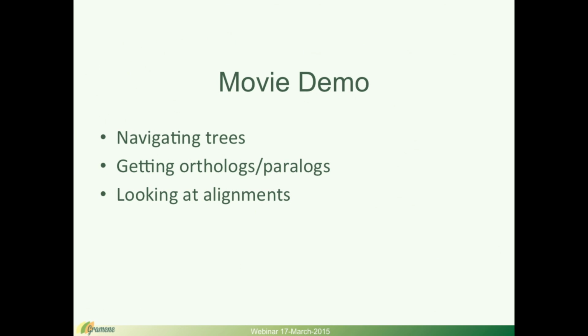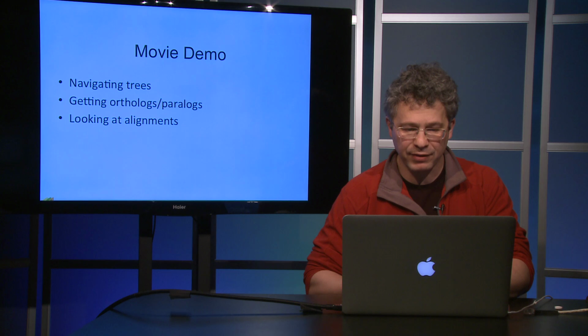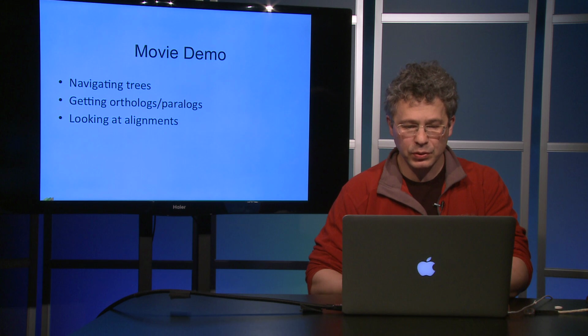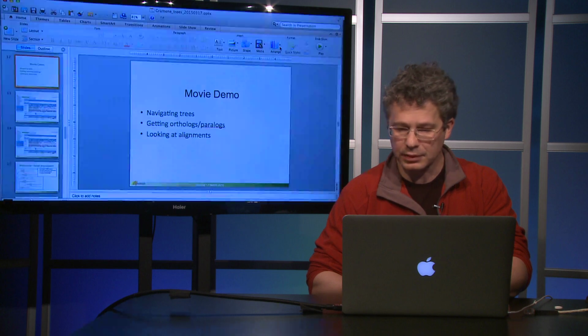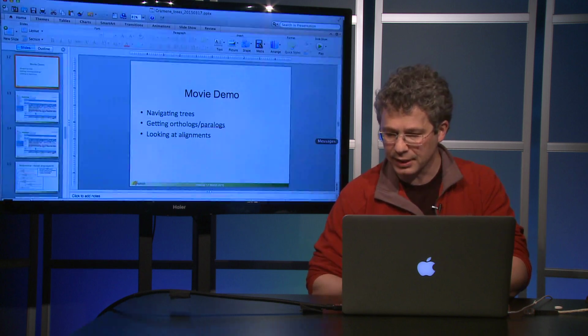And I'm going to now switch to a movie demo, and I'm going to demonstrate navigating gene trees, how to browse and get to orthologs and paralogs of genes, and also looking at the alignments. So this is a 10-minute video.